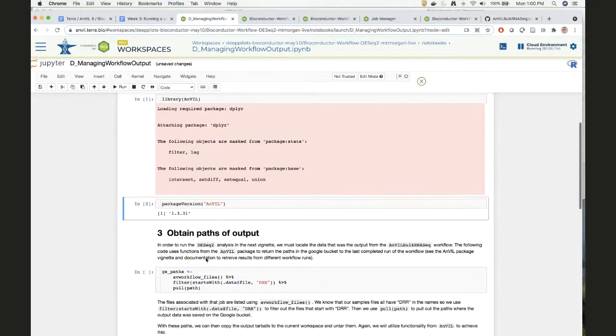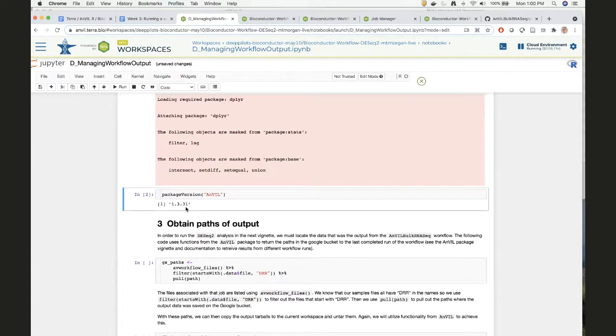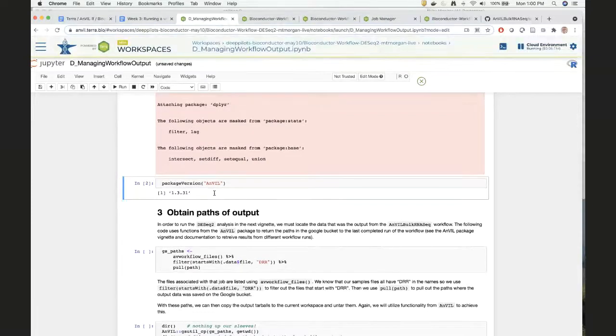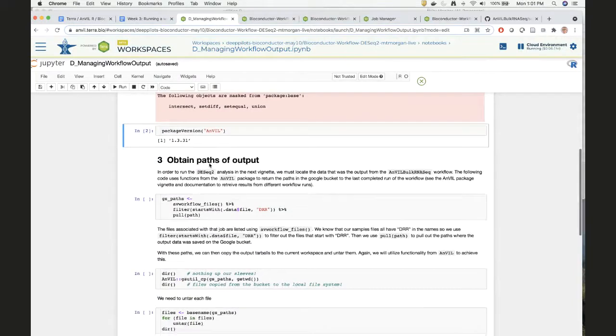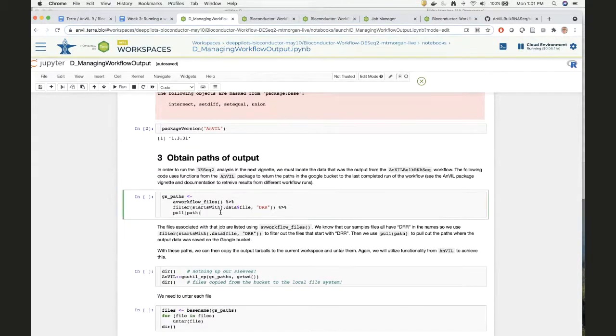Great. Actually, this is the development version of the AnVIL package. I think that the script, even though it ran into problems, I'm not sure. Maybe there are problems here. Maybe you didn't have problems. Maybe your scripts ran all the way to completion, your installations.